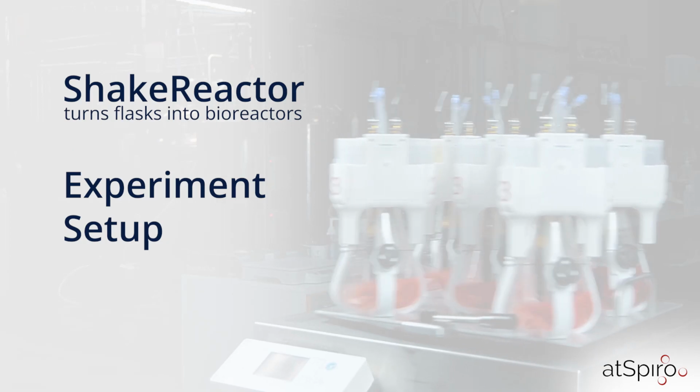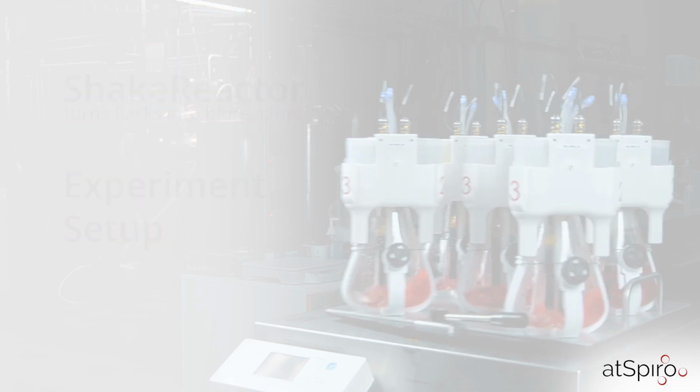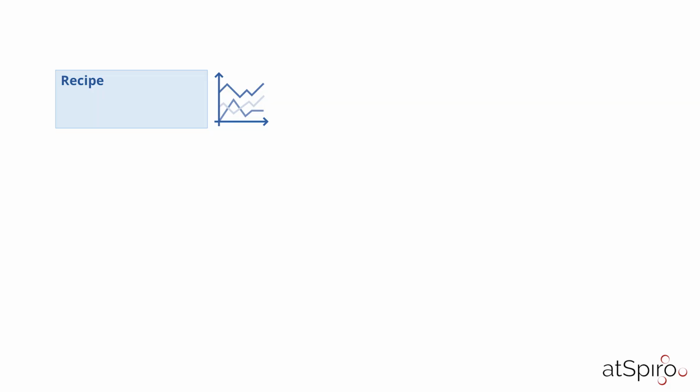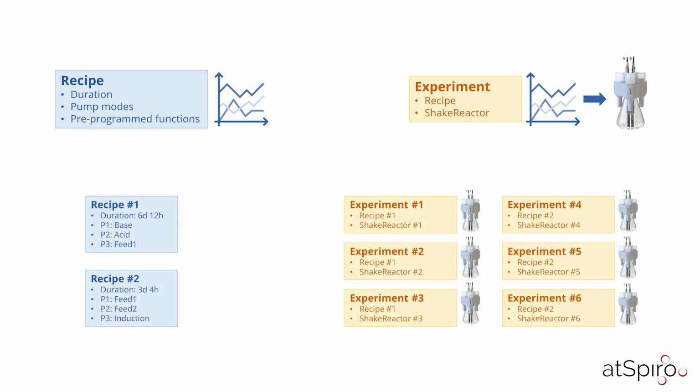Setting up experiments with atSpiro ShakeReactor is straightforward. The set of instructions specifying how a single device behaves during an experiment is called a recipe. It allows defining experiment duration, pump modes, and pre-programmed functions like pH control, feed profiles, or induction points. An experiment is then the actual execution of a particular recipe on a specific ShakeReactor. This allows running multiple unique experiments with either the same or different recipes each.